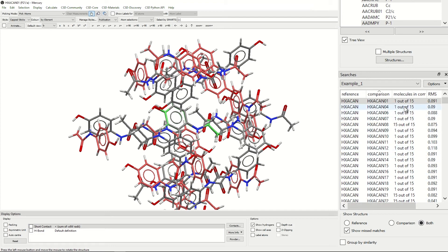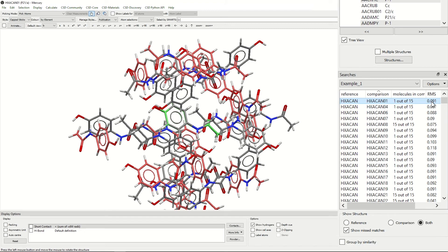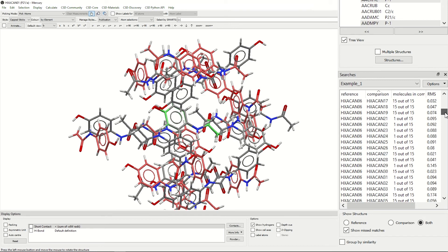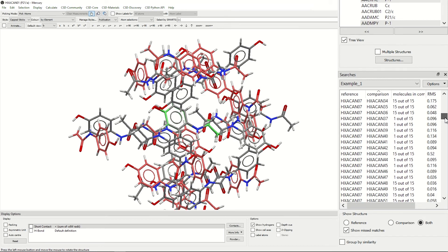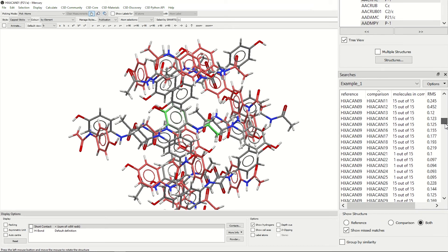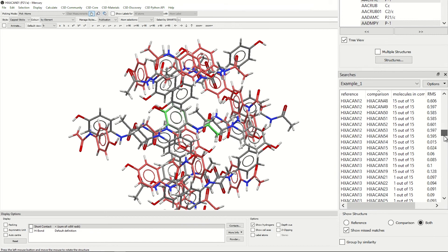As you can see, this has an RMS of 0.091. As the lower the RMS, the less variance there is between the structures. Looking further at this list by scrolling down, we can see that every ref code for each member of the paracetamol family has been compared as a reference structure and a comparison structure.